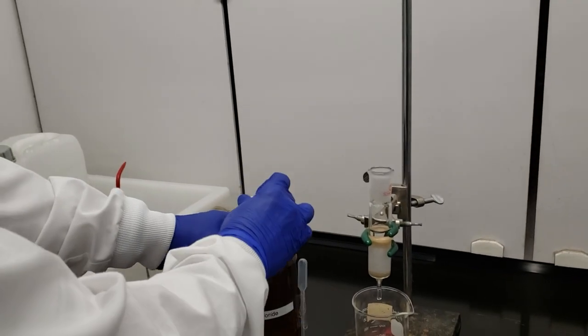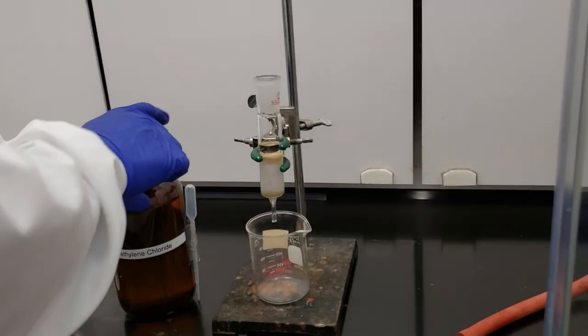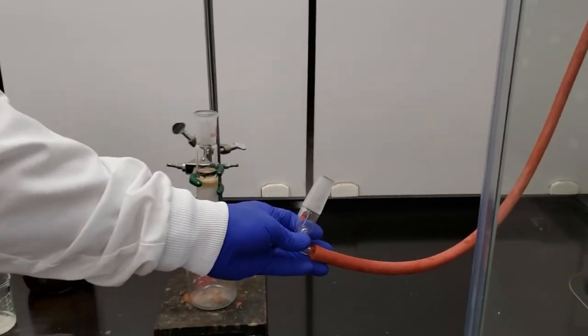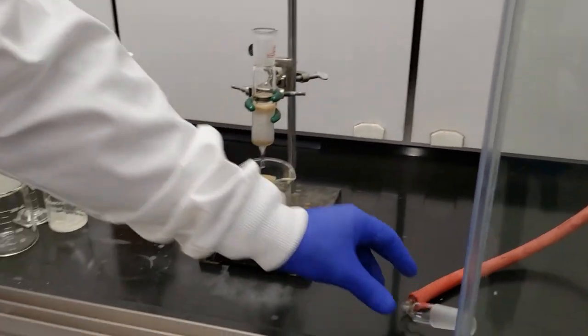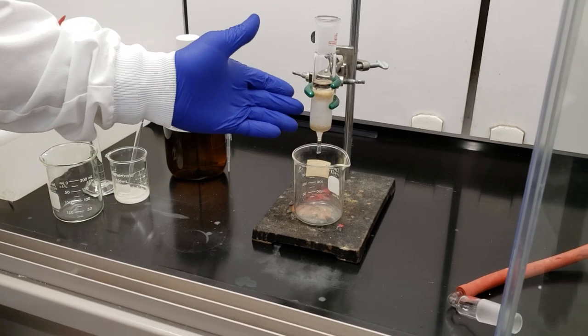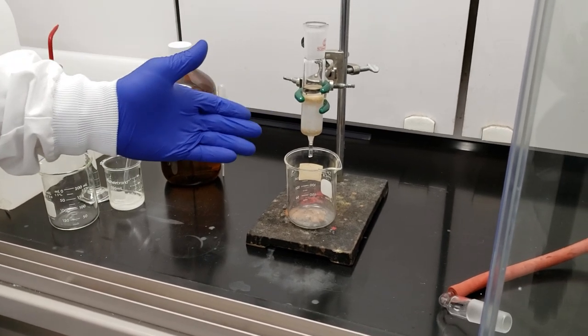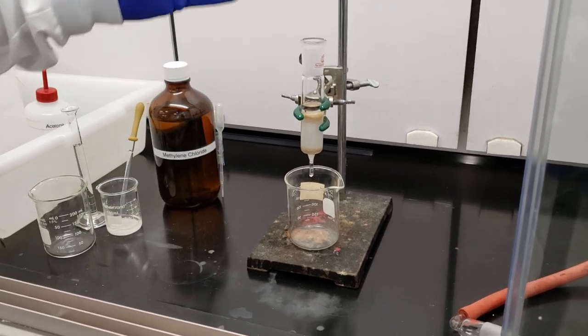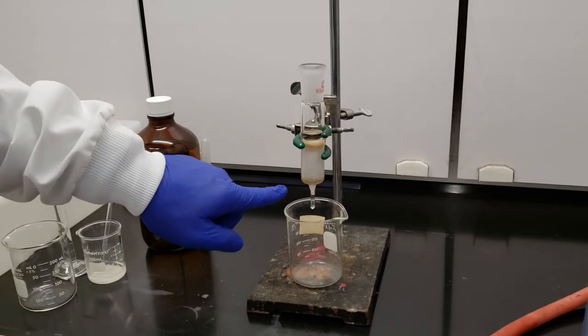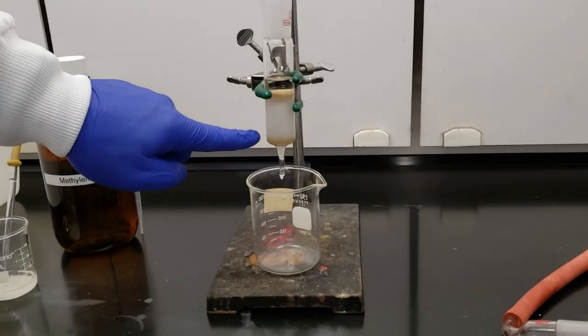Should be a sufficient amount. What I'm going to do now is use our air hose in the hood to apply a little bit of pressure here. If we allow this to move through the column under gravity alone, it can take a considerable amount of time. But using our air hose to push it through will help us pack down the column, close out any of the air pockets. I don't know if you can make those out.